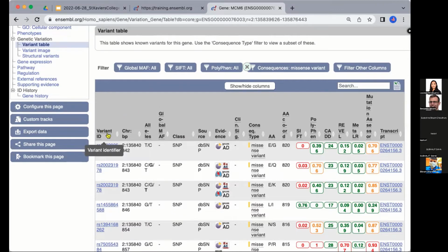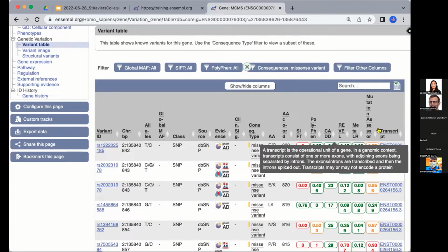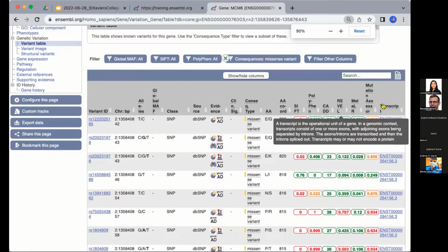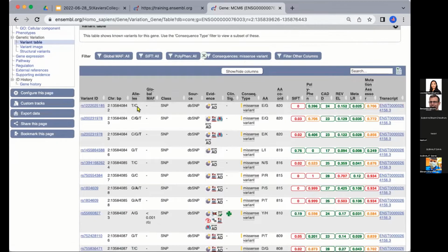The headers look a bit funny on my screen. That's because I'm zoomed in. But if you are doing it on your own laptop, or if you zoom out, you can see that it actually adjusts. So just bear with me for this zoomed in version.